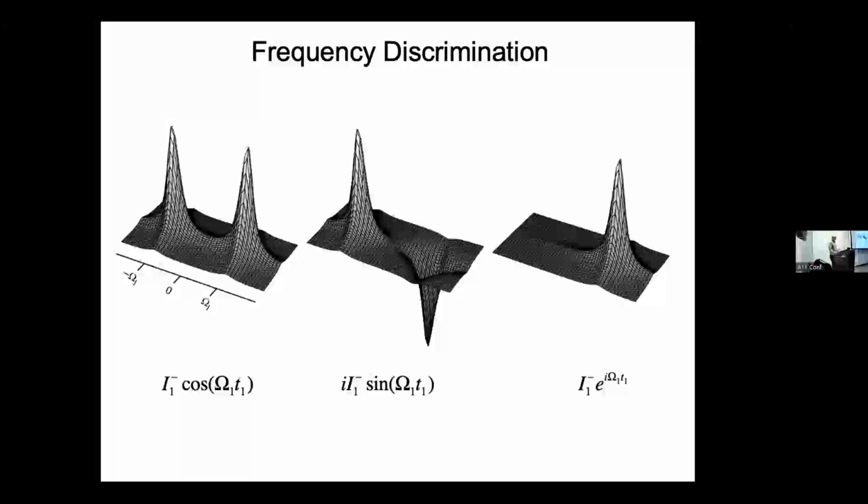Of course, you may notice sometimes when you're calculating two-dimensional spectra or three-dimensional spectra, sometimes you'll notice that the spectrum looks upside down relative to what you expected. And that just means that this addition process happened incorrectly, so that you ended up with the other component rather than the one you wanted. And this depends on the nature of the pulse sequence, et cetera. One can always calculate it, but usually when the spectrum looks upside down, you take the complex conjugate and it flips around.